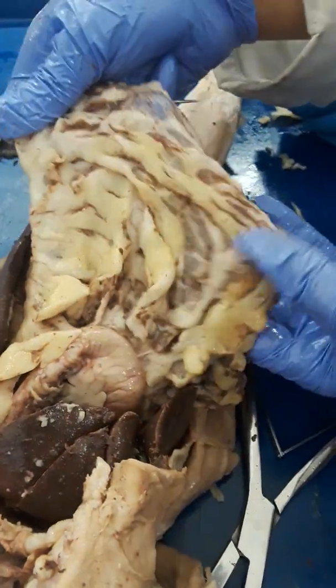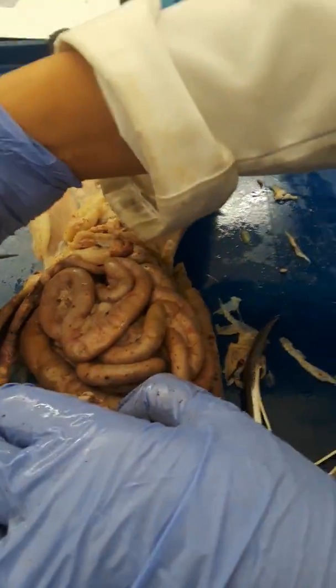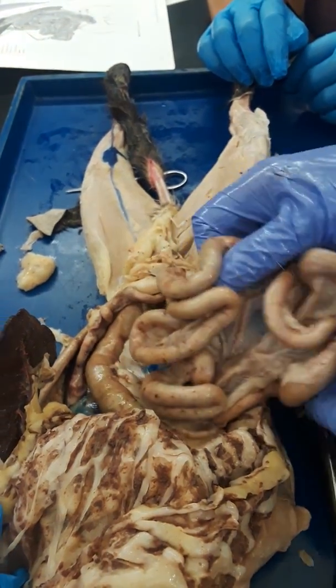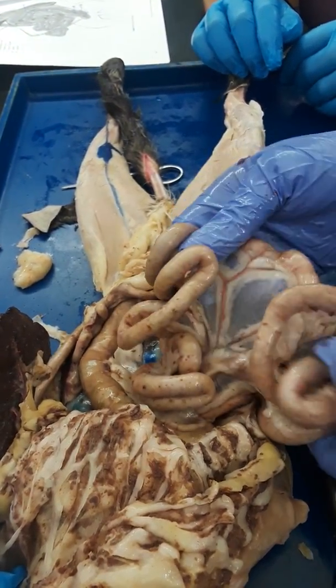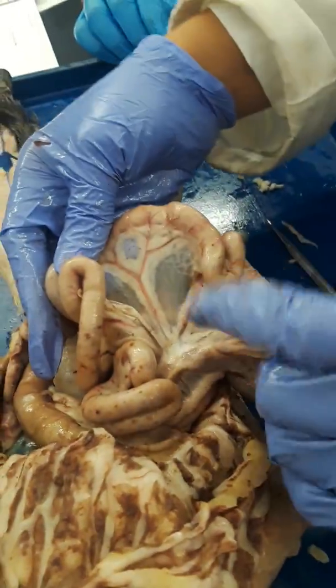This blanket of connective tissue is called the greater omentum. We pull it back. You can see the spleen, small intestines, and there's a connective tissue that contains blood vessels that provides nourishment to the small intestines. It's called the mesentery.